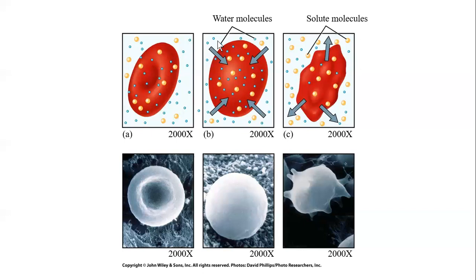So in hypotonic environment, hypotonic solution, red blood cells will inflate, and sometimes the event hemolysis occurs because the red blood cell membrane bursts and hemoglobin is just spewed out into the environment. So panel B is the look of a red blood cell in hypotonic solution.